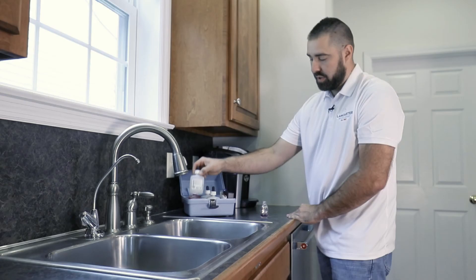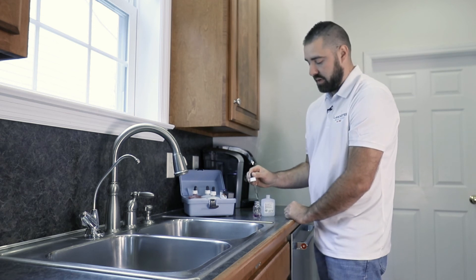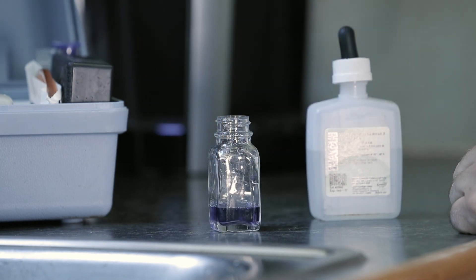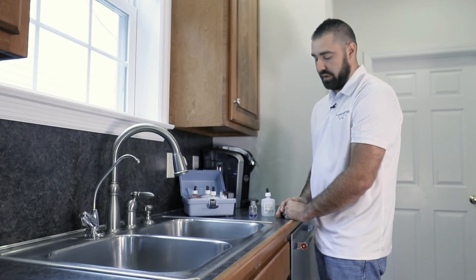If the water were hard, you would take number 3 and count the drops as you put them into the vial, swirling each drop. When the water turns blue, that is the total number of hardness you have in your water. In this instance, we have one — so it's one grain hard.